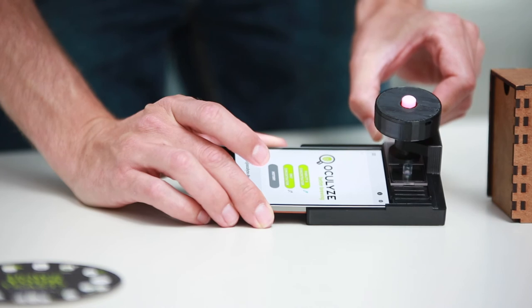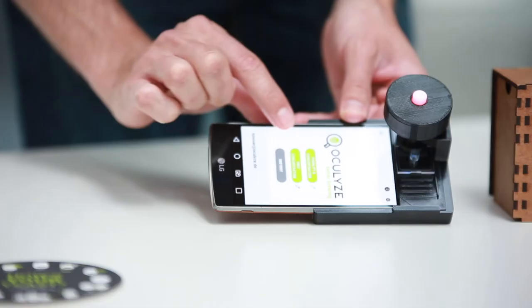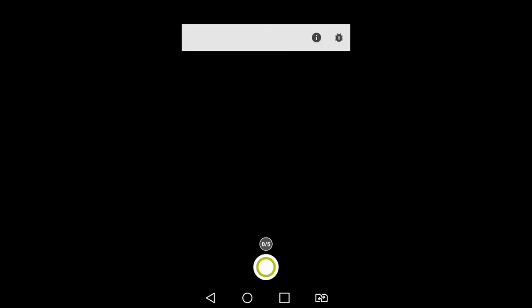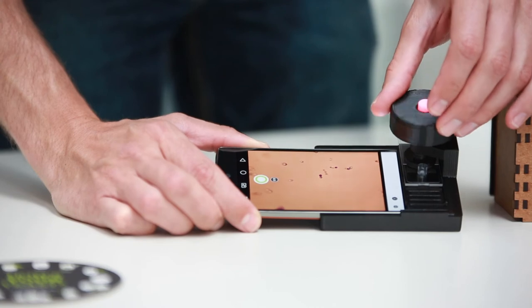Step 4. Slide the sample chamber up to its first marking. Step 5. Choose which measurement you would like to conduct. Step 6. Now you need to focus the images by adjusting the knob.